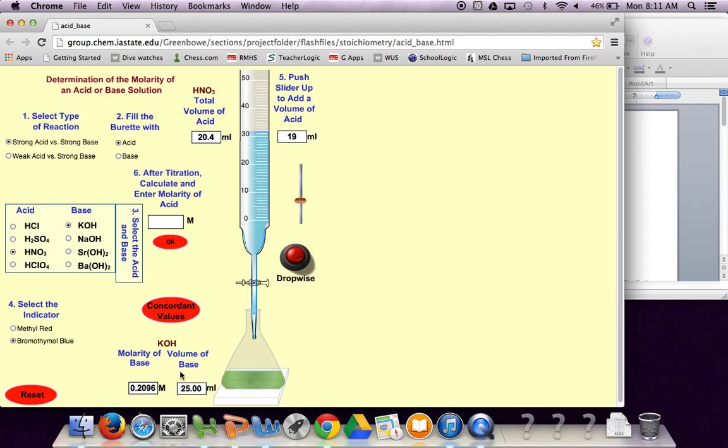We know how much acid that we used so we can calculate the concentration of our acid.